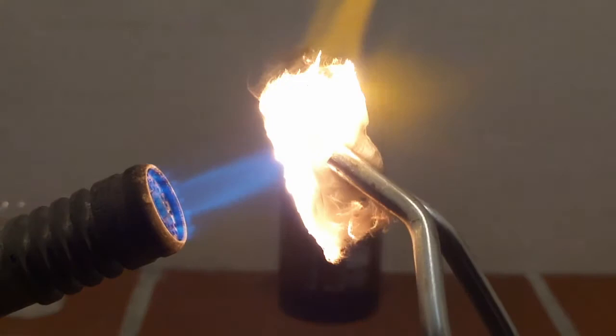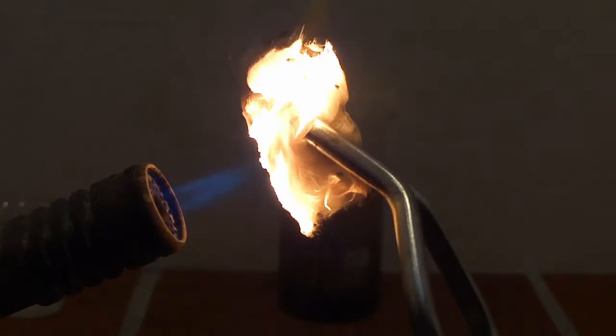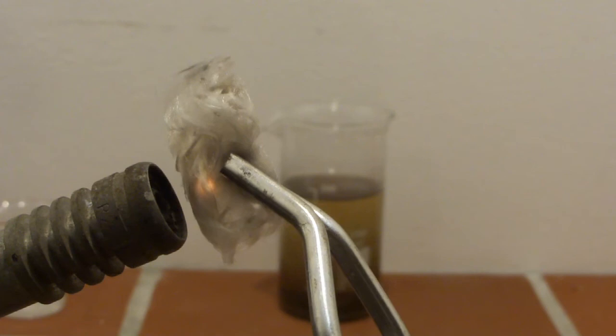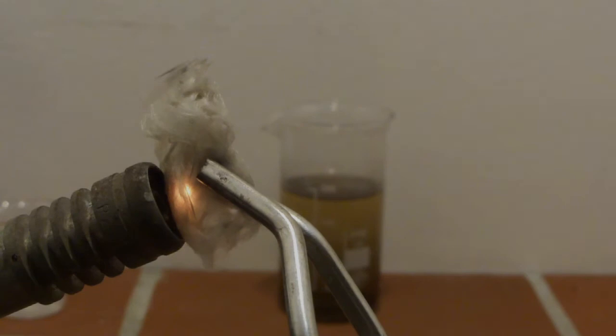Now for some warnings. Do this preparation outside or in a fume hood, as toxic gases and acid vapors are formed. Platinum salts are very toxic if ingested. Keep the platinum catalyst away from hydrogen, methane and other combustible gases. When these gases come into contact with the platinum catalyst, they can spontaneously ignite. We will demonstrate this property in an upcoming video.